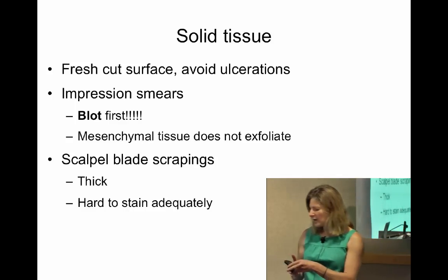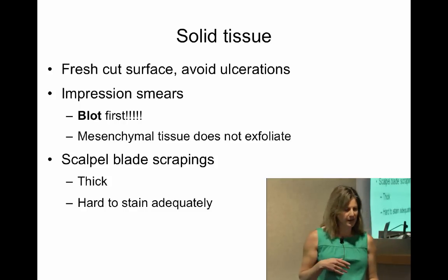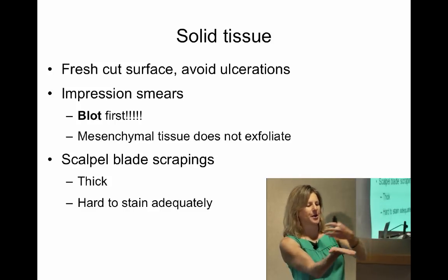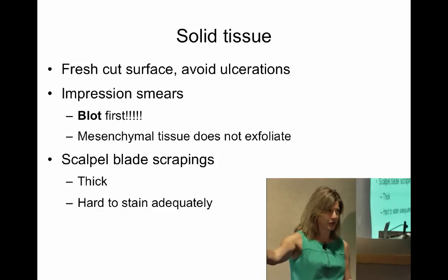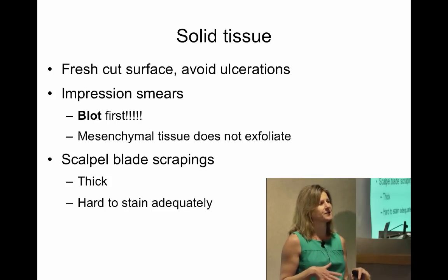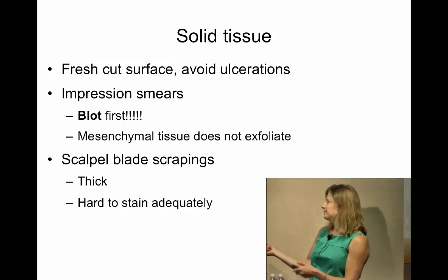If I get a big enough piece of tissue and it comes down as tissue to compath, what I usually do is take a scalpel blade, and I take a fresh cut surface, and then I put the scalpel blade just like that, and I scrape. And then I wipe the edge of the scalpel blade on the slide, and that's when I put a little bit more pressure. So I know that areas are going to be squished to glory, but other areas are going to be beautifully well preserved, and other areas are going to be too thick. And that's also what we have to do as a cytologist, is we have to find the right area to look at. And that's also quite key. And there's also an art to it which you learn. And I'm going to go through that.